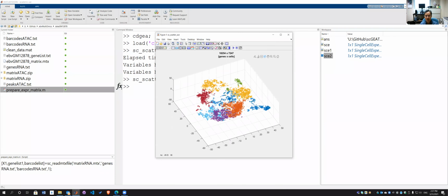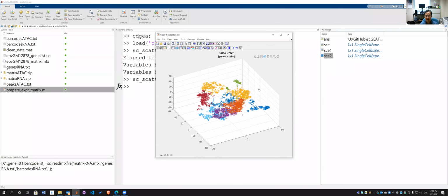Once you bring it up, you don't see the names, the labels of the clusters, but you can label the clusters. Press this button. You can change which type of cluster label you want to use. But here I know it's from a cell type. So the cell type TX means it's text, and label with text. So that's my current data. I reloaded after I shut down my interface, and I still have that annotation. You see the B cell annotation is still here.